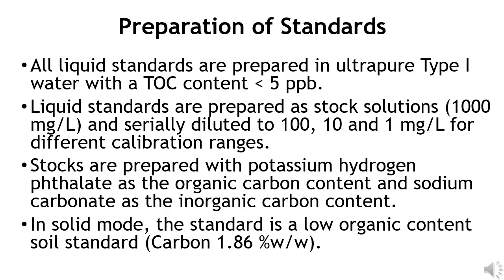Preparation of standards. Liquid standards are prepared using ultra-pure type 1 water with a TOC content less than 5 ppb. All standards are prepared as stock solutions of 1000 mg per liter TOC and TIC and serially diluted to 100, 10, and 1 mg per liter to set up different calibration ranges, since this improves accuracy.